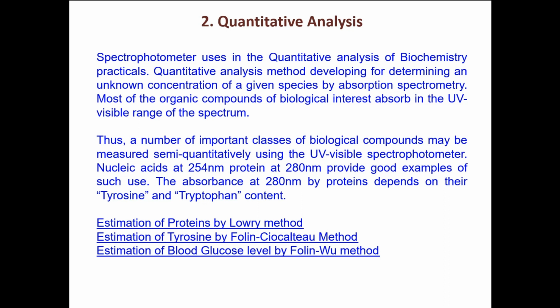So likewise, I will go for either 2 minutes or 1 minute. It depends on what you want to do. So that's why you can see there is a progress in the NADH. That means the increase in the concentration of the NADH is directly proportional to the enzymatic reaction.